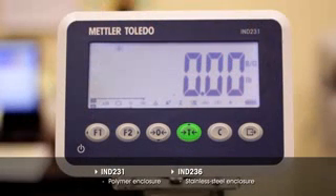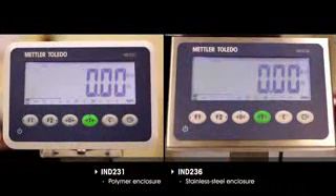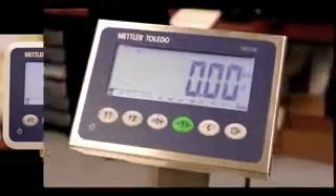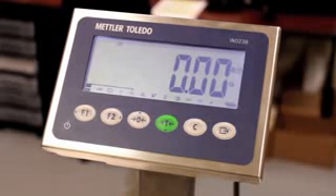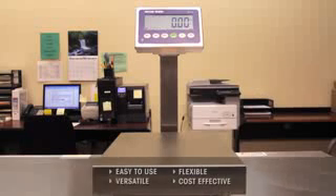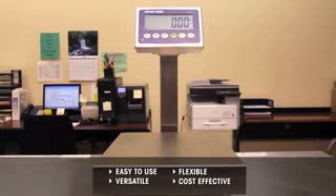Whether your process requires the lightweight and cost-effective polymer enclosure of the IND231 or the rugged stainless steel enclosure of the IND236 — built for easy cleaning and to withstand washdown with aggressive solvents — you can count on Mettler Toledo for a terminal that addresses the environment in which your process operates. Easy to use and versatile by design, both the IND231 and IND236 are flexible, cost-effective additions to any weighing operation.